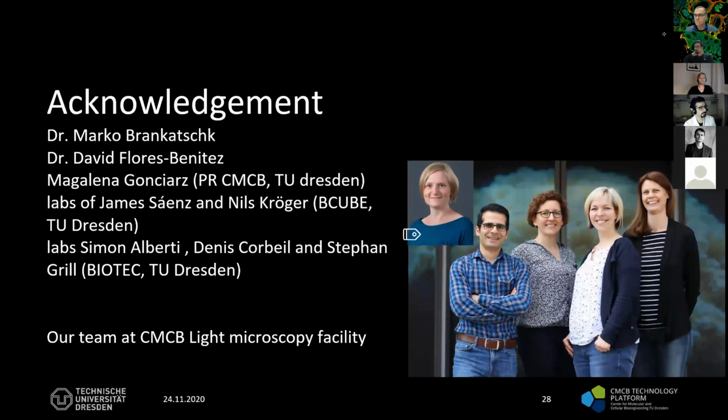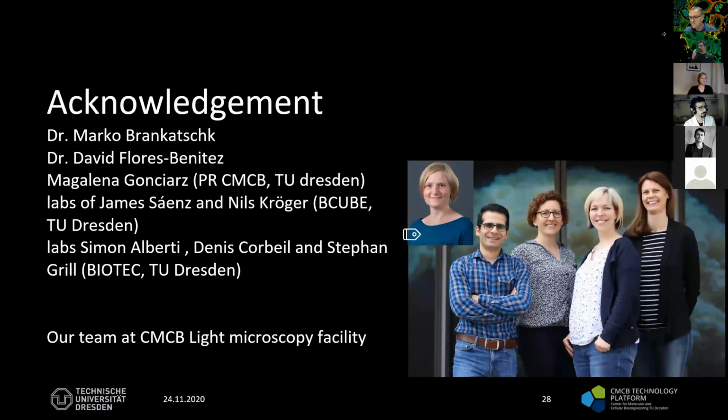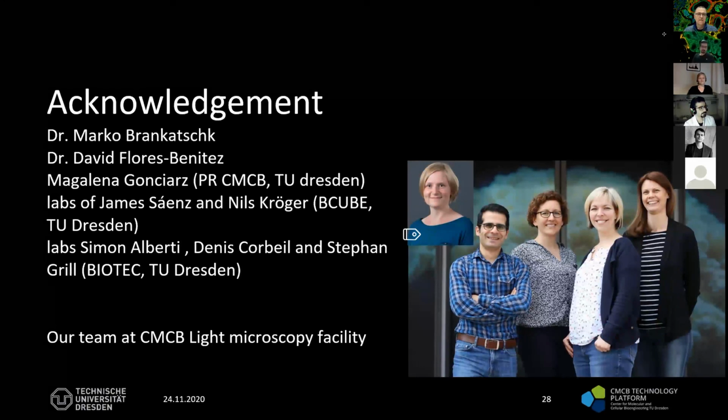Okay, Mariana has mentioned that intensity-weighted is the one that people should use in TCSPC. And Amazi mentioned that amplitude-weighted is always correct and reproducible. So that's what I see in our system, that amplitude-weighted is reproducible and more robust. And that's true for FRET, where it is specifically mentioned that we have to use amplitude-weighted. But what is the reason? To be honest, I really don't know. It's just how we are conducting the experiments here.